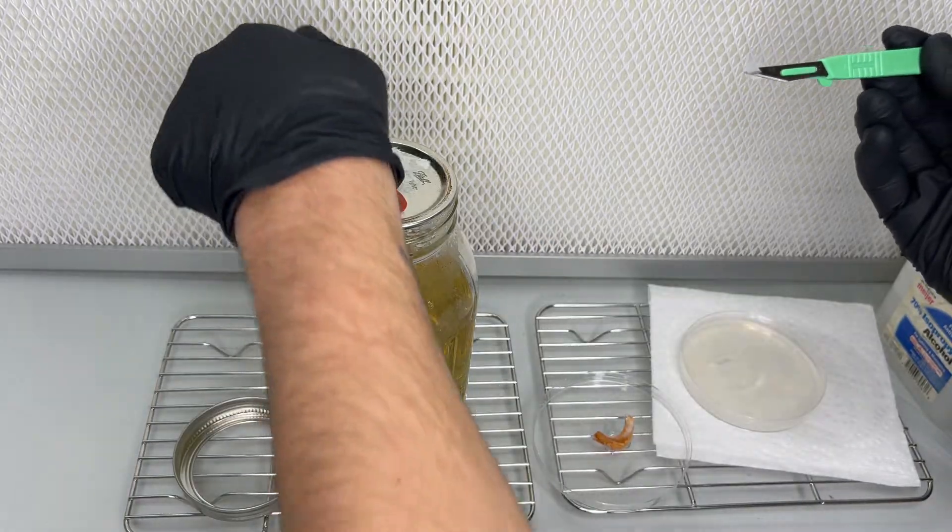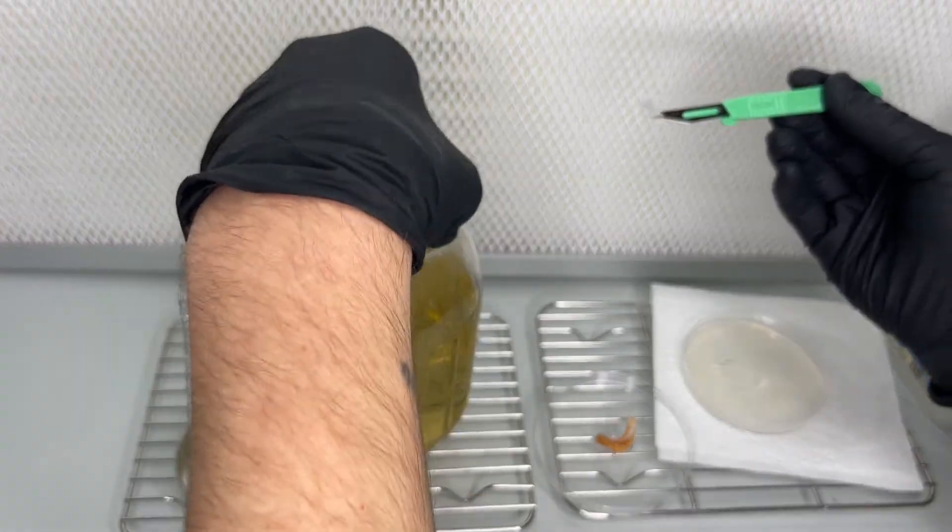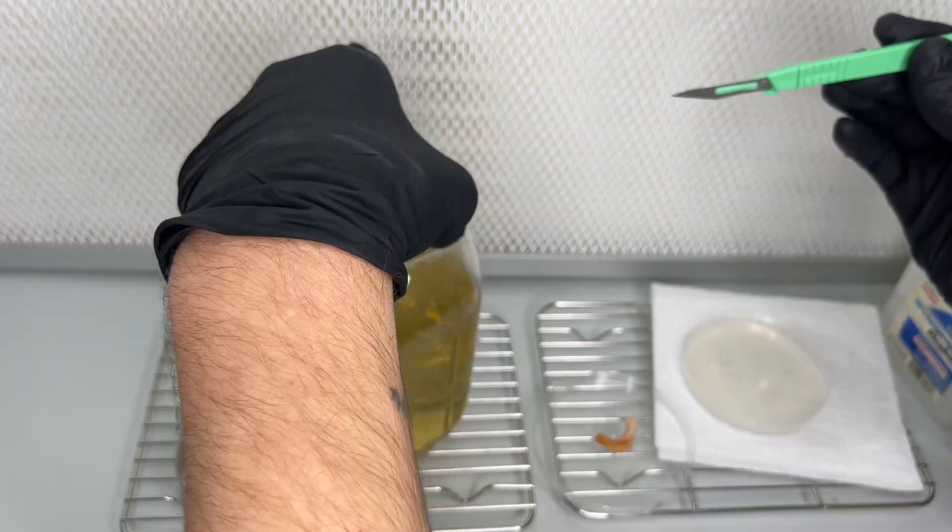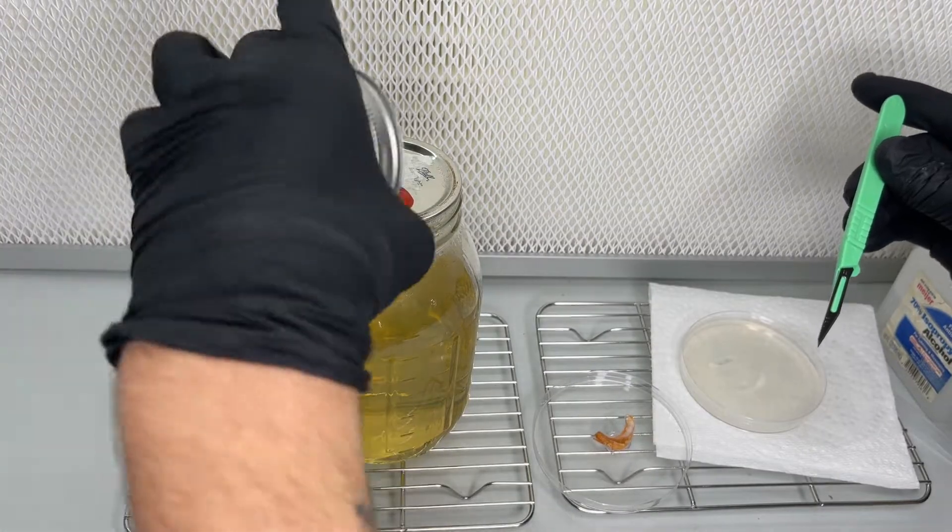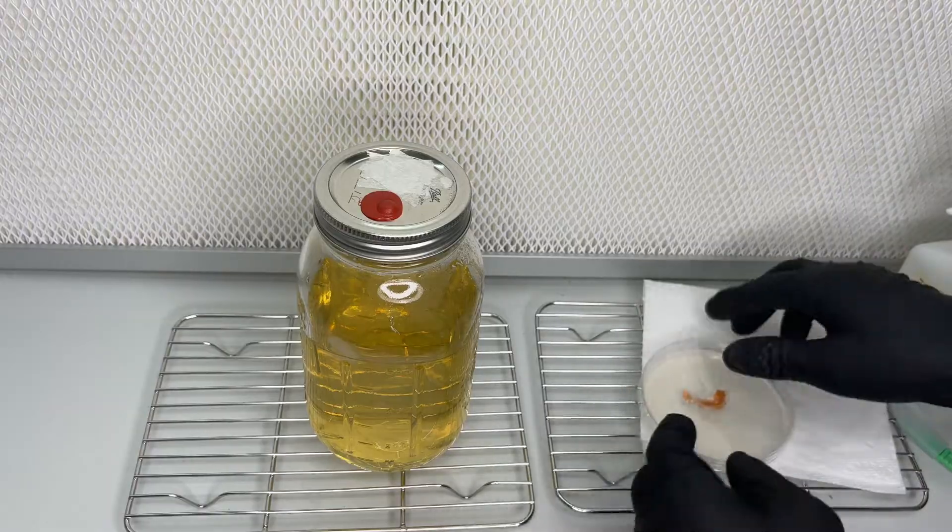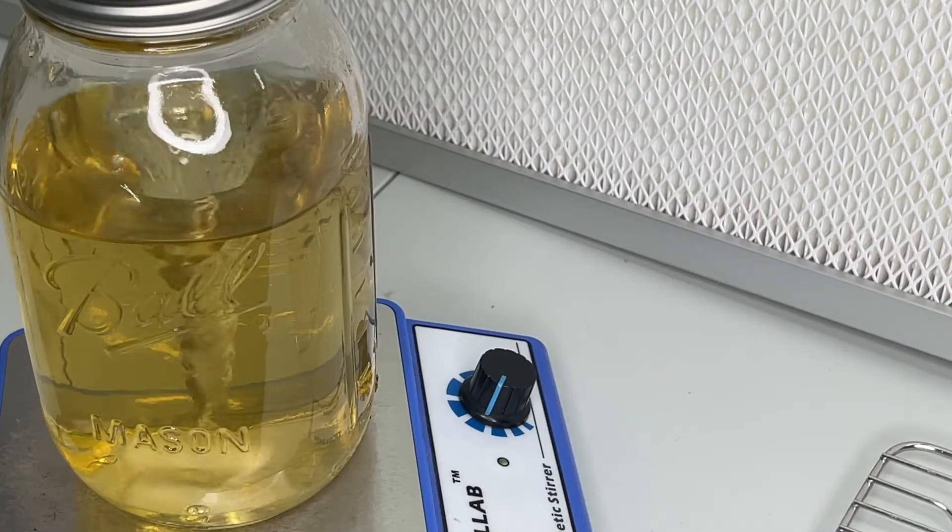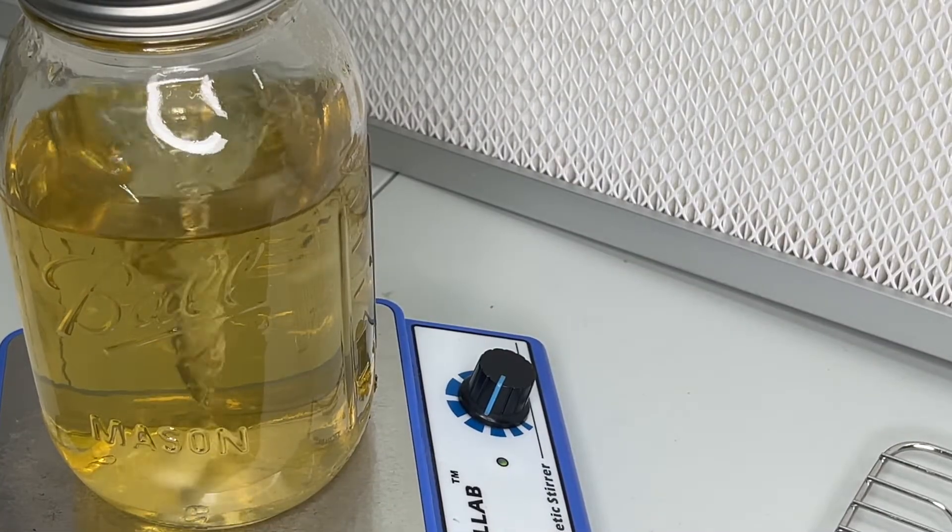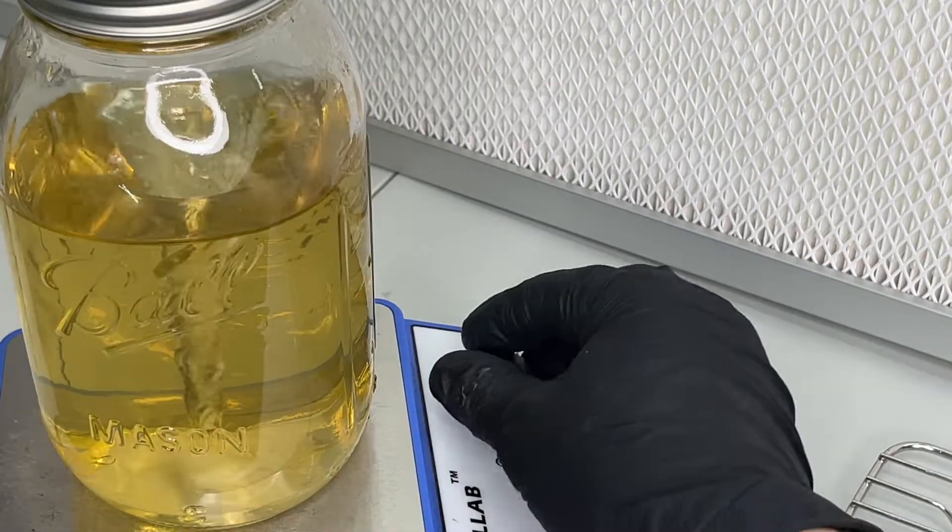After the wedge of mycelium has been added to the liquid culture jar, it is magnetically stirred for a few minutes every day for two weeks and stored at 70 degrees Fahrenheit. After about two weeks, it should have generated enough mycelium to make multiple syringes.